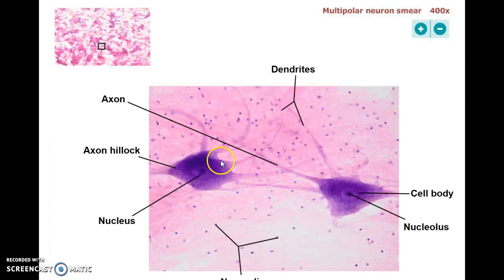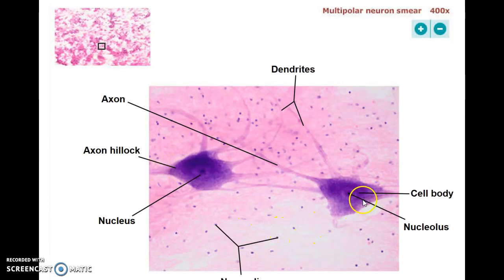Under higher power you can see the cell body, you can see dendrites where you can clearly see them branching, the probable axon coming off the bigger part of the cell, obviously the cell body with its nucleus, and a bunch of neuroglial cells — those might be astrocytes or microglial cells, the immune cells.